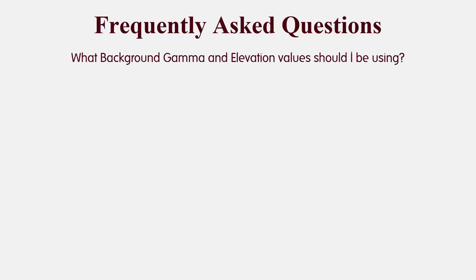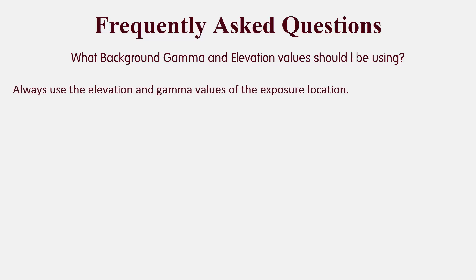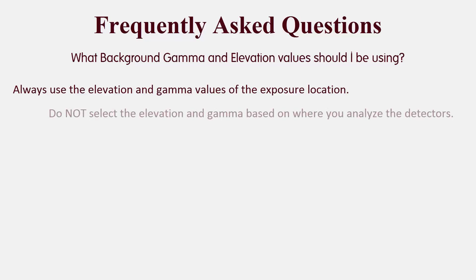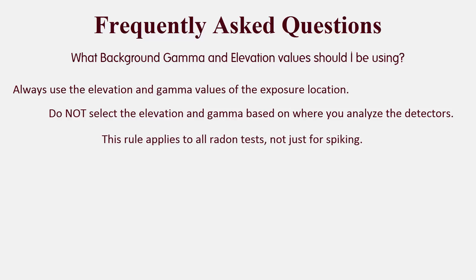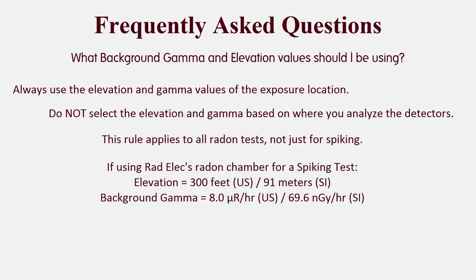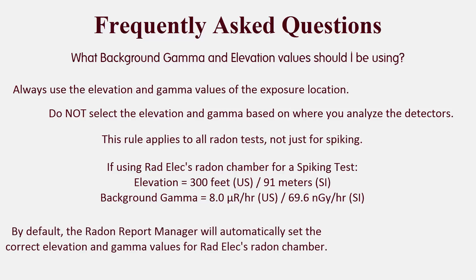One of the most common errors we run across: what background gamma and elevation values should I be using? Always use the elevation and gamma values of the exposure location — do not select them based on where you analyze the detectors. This rule applies to all radon tests, not just spiking. For example, if you read your electrets on top of a mountain but deployed them in a valley, you must use the elevation and background gamma of that valley. If you're using Radelec's radon chamber, the elevation is 300 feet and the background gamma is 8.0 micro-R per hour — or 91 meters and 69.6 nanograys per hour in SI units. By default, the Radon Report Manager will automatically set the correct elevation and gamma values for Radelec's radon chamber, but this option can be disabled.